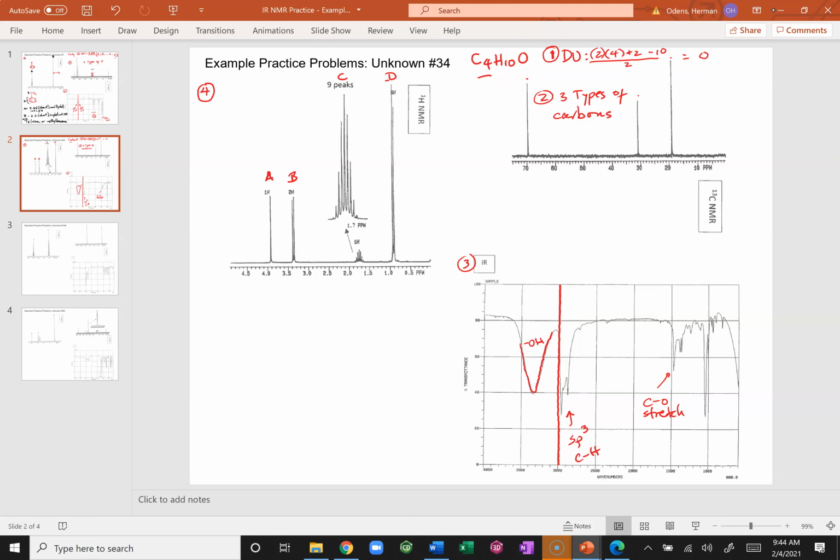So what do I see here? I see a singlet that integrates for 1H. What do you think that signal is based on your infrared? The OH is by itself. The electrons on the oxygen block any splitting from the H towards any carbons that have hydrogens. Therefore, that's an isolated signal. So I'm going to assign this as an OH, and because I have an oxygen there in my formula, I have to assign that oxygen. I'll get rid of it right away.